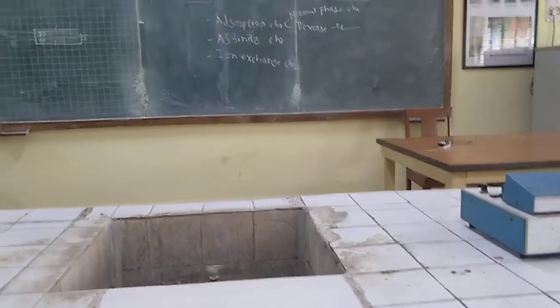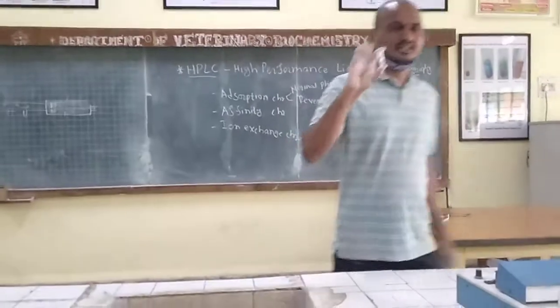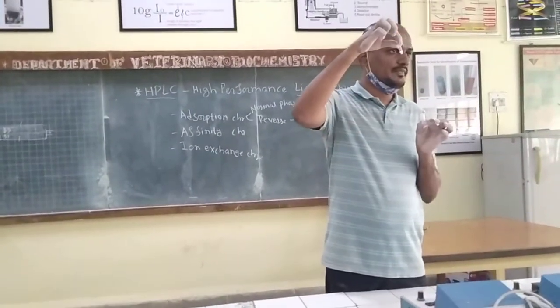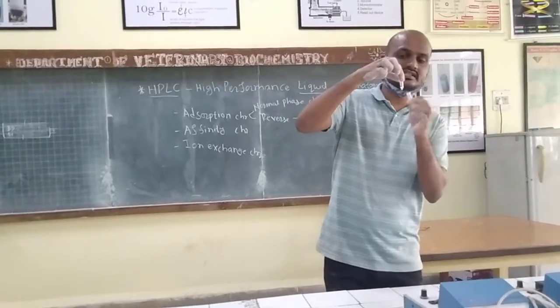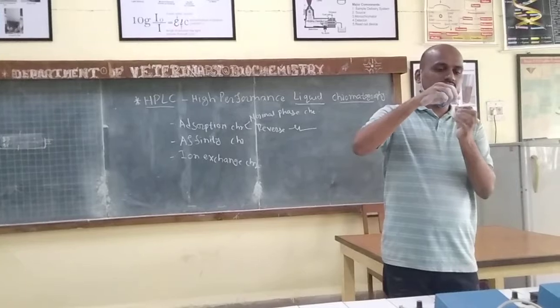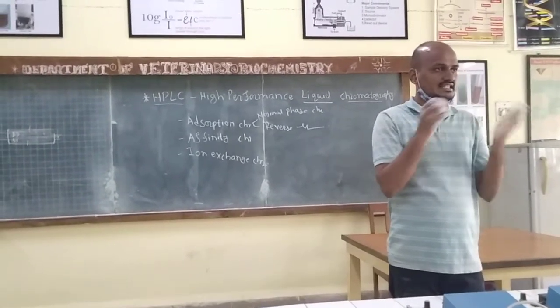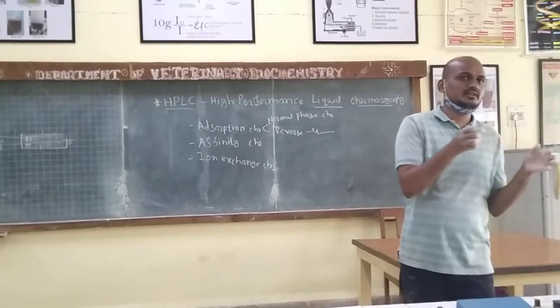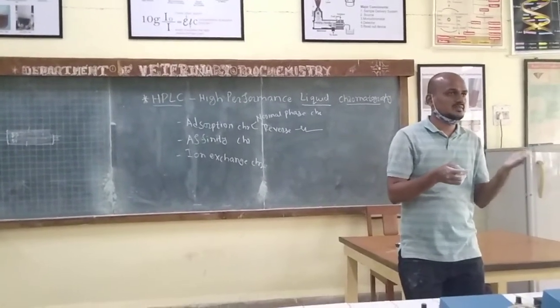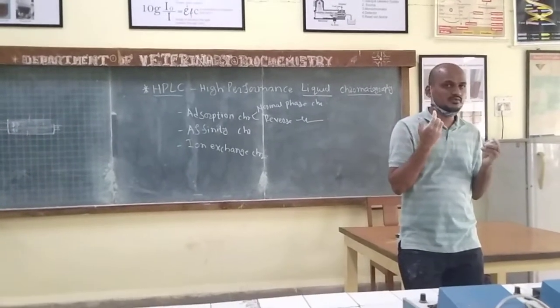So we are talking about affinity chromatography, right? For example, this one is a simple column. So this nucleic acid is there. It is getting attached with this membrane, and then we do all the steps. First, we take bacteria and lyse that bacteria. We do resuspension, lysis, and neutralization. Then we are centrifuging it.